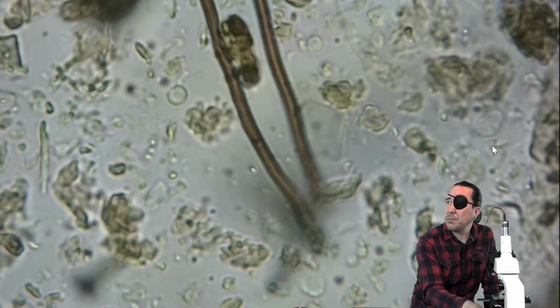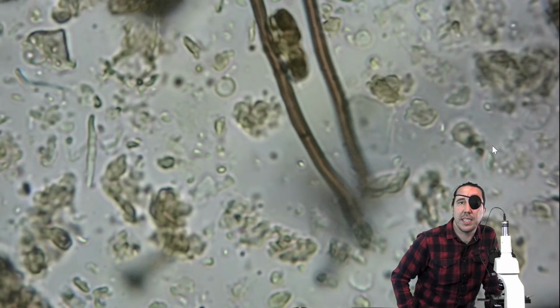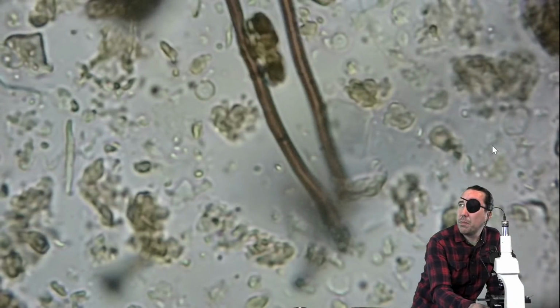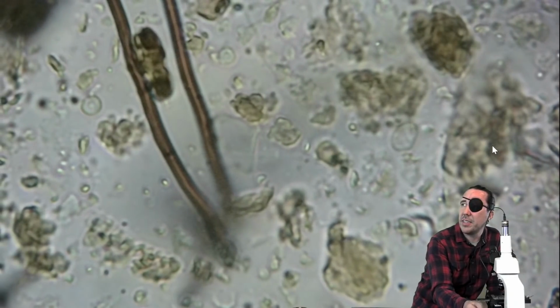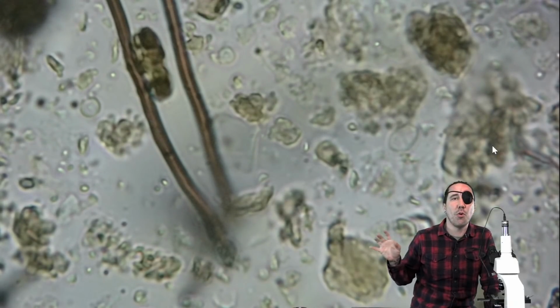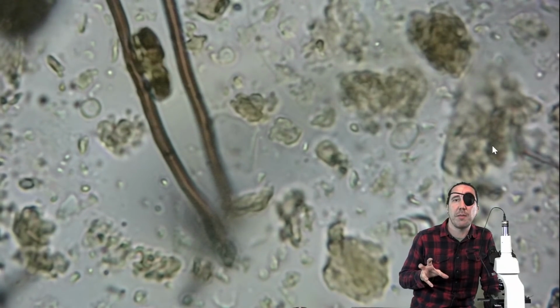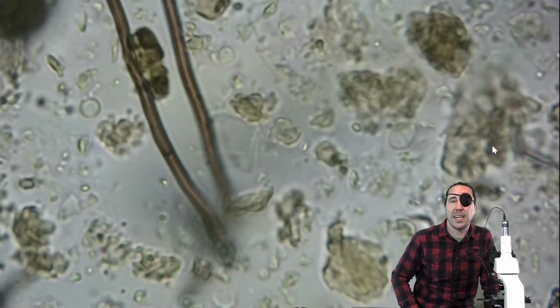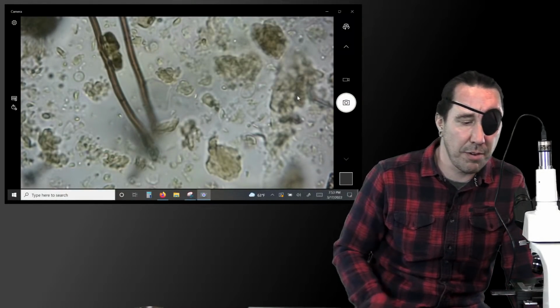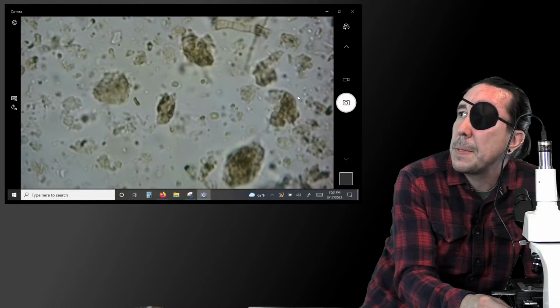Like I said, usually I'm seeing bacterial feeding nematodes. In a sample, you want to see either bacterial feeding nematodes or other protozoa that are going to be eating bacteria so that they're cycling those nutrients. So generally, I either have more testate amoeba and flagellates or more nematodes. There might be a few nematodes and not that many testate amoeba, or the opposite, there might be a good amount of testate amoeba and really not any nematodes. And it looks like that might be the case in this sample right here.